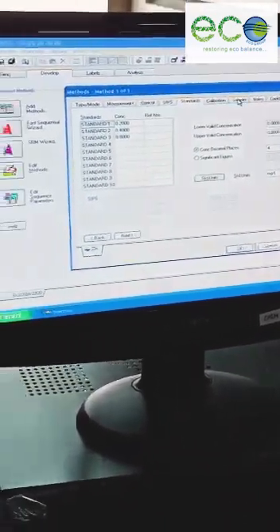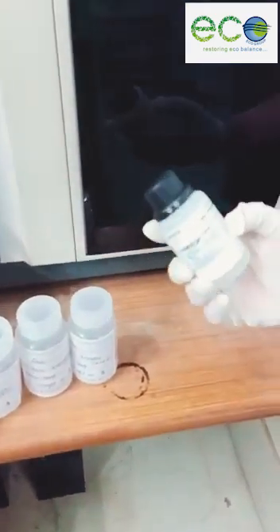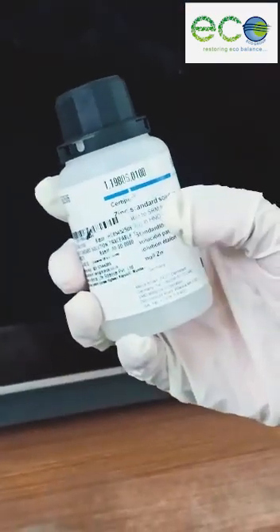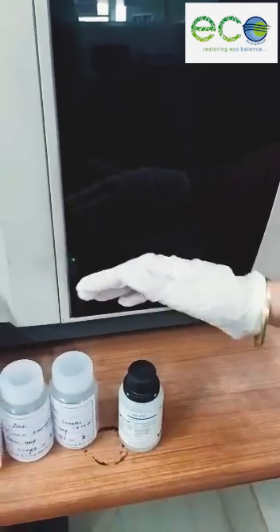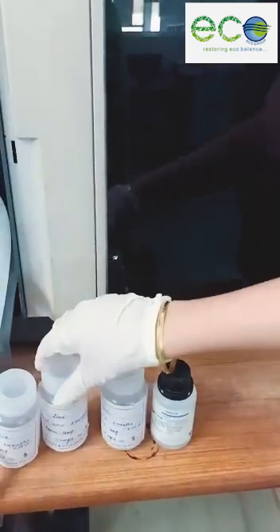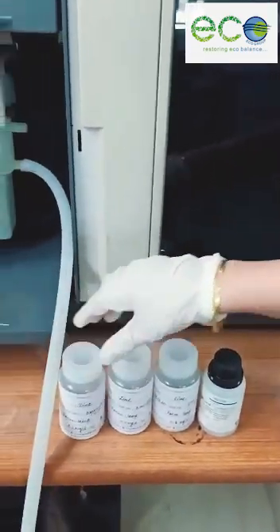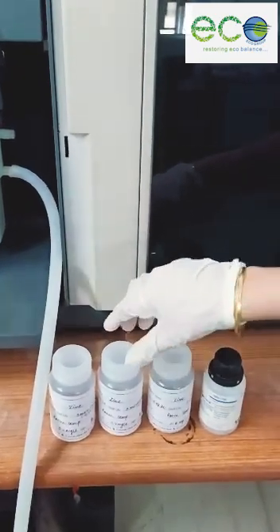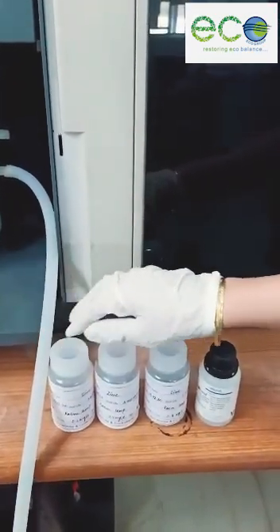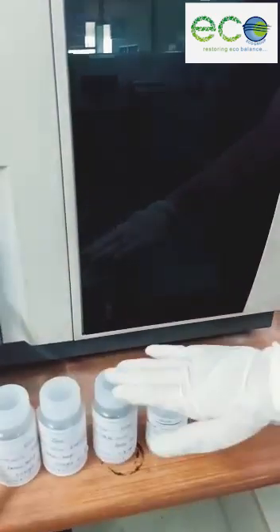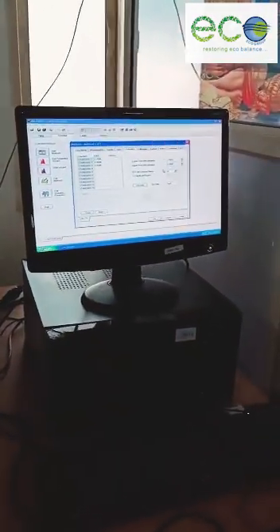And we will put the CRMs. This is the CRM for Zinc, 1000 ppm. I have prepared further dilutions from this. So based on these dilutions, I will prepare a calibration curve.